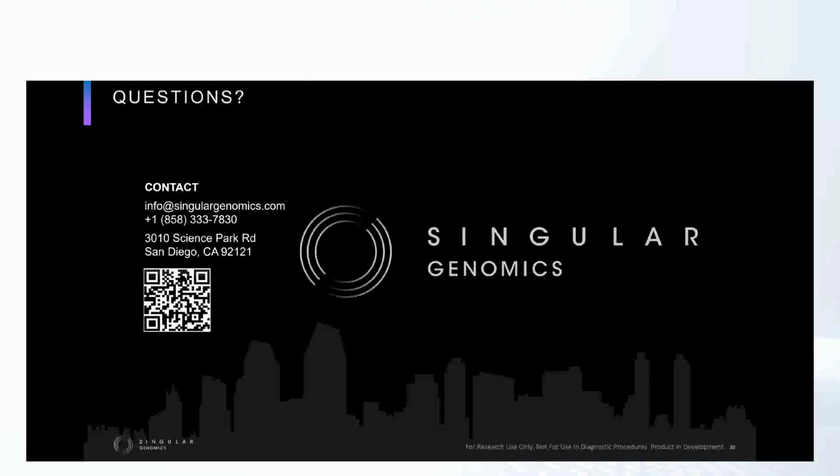You mentioned you do transcript counting, but you also do the sequencing. Are you doing them simultaneously, or are these separate workflows? So we're actually sequencing to identify the transcripts. We're sequencing the footprint binding region in the transcript. So it's natively in situ sequencing is what we're doing.